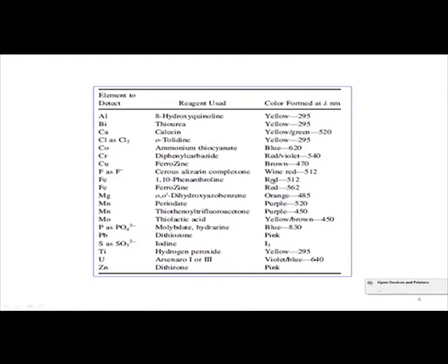Earlier we used thiocyanate to get a particular type of complex with a minimum stoichiometry of 1:1, and the corresponding intensity is very high and is not a simple color change for the transition based on the iron as the Fe site. All these things are written as the metal center, because it is the element to detect, but not in this particular form. These are all in the ferric state or the ferrous state.